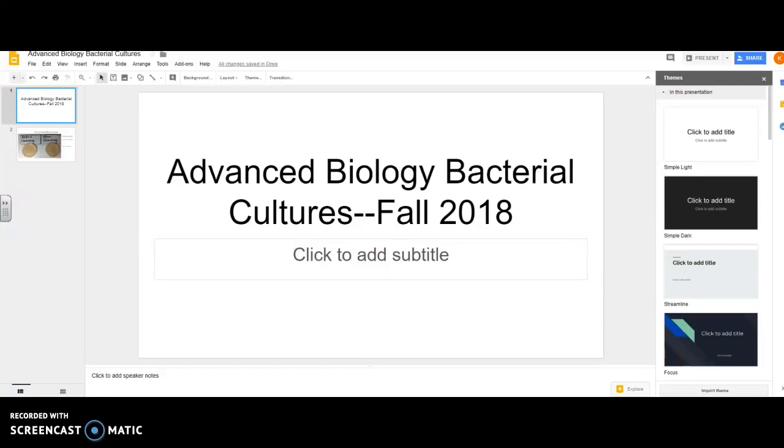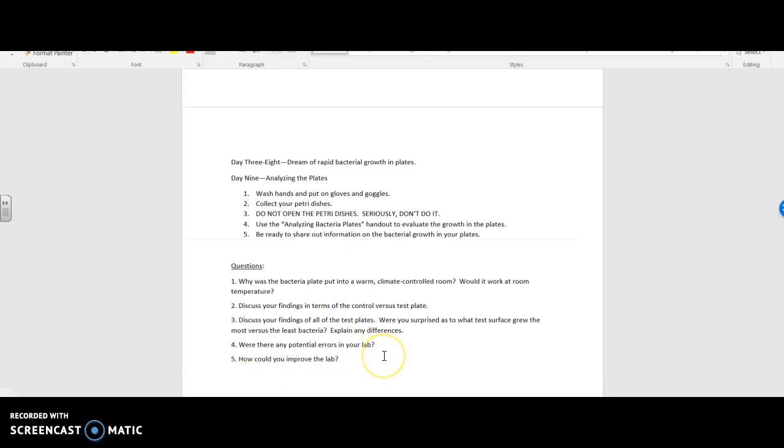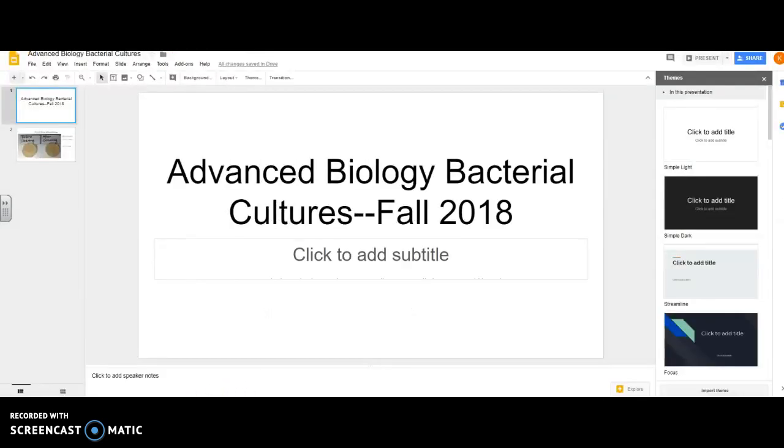I just wanted to make a little video to explain to you how we're going to finish up our bacterial cultures lab. So first of all, we do need to share out the data so that you guys can complete the information on the lab handout. If you guys notice down here in the question section, there is a part that looks at all of the findings. So what we're going to be doing to share out that information is adding pictures and bacterial counts to this Google slideshow that I have created.